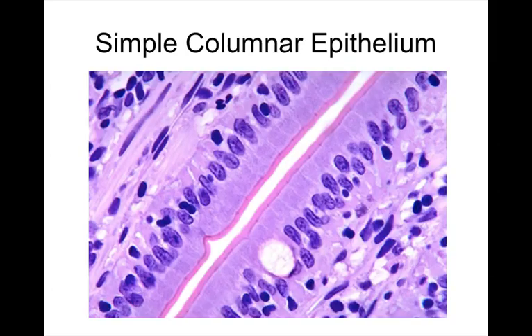Okay. All right. Now, simple columnar epithelium. Again, where's the free space here? The white space that's outlined inside of the blurred line that you can see are the microvilli. Yes. So how do we tell? We have some basic characteristics here. We can see that there's a little space here in the center. The cells are tall, and the nuclei tend to form a zone, where they're not all randomly jumbled through the cells. Most of the working, absorptive parts of the cells are toward the apical surface.